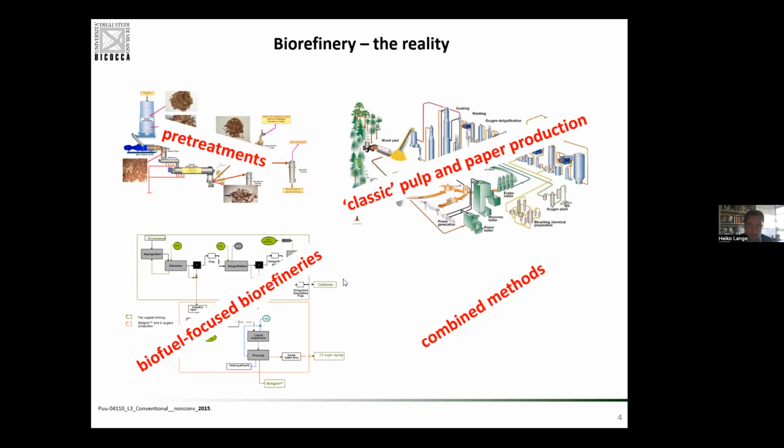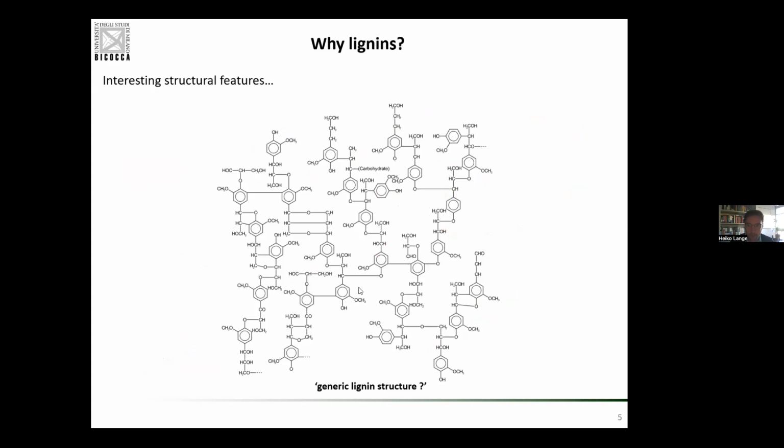The interesting thing in all this is that we have our lignin as a product that has in its structure a recording of the process that has been used for isolation. And this is one of the major problems if you think of a valorization of the lignin. And it is one of the major issues that, apart from the natural differences in the lignin that come from the biomass source, we have the additional differences that come from the processing.